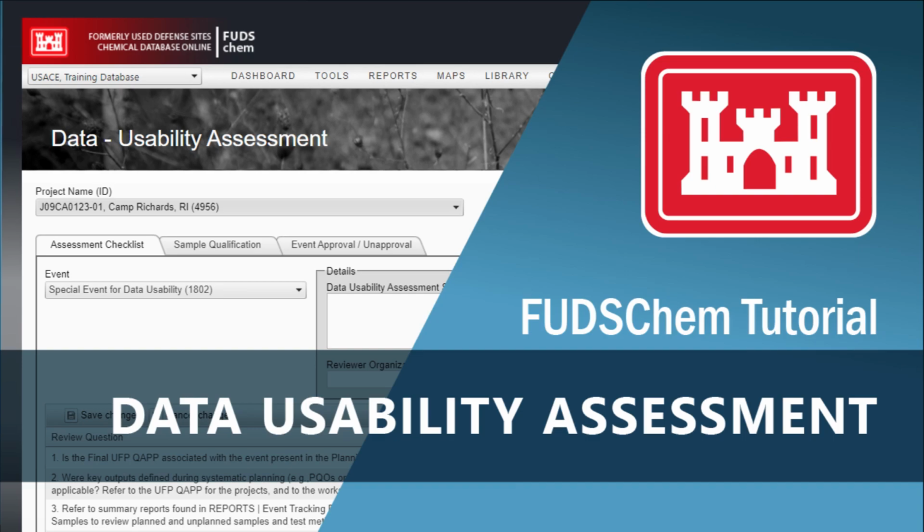This video will go over the basics of the Data Usability Assessment, or DUA, tool in FUDSChem. This tool provides a way to document the Data Usability Assessment for your project.